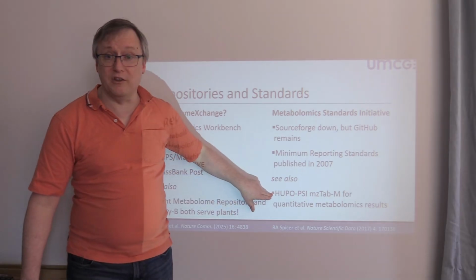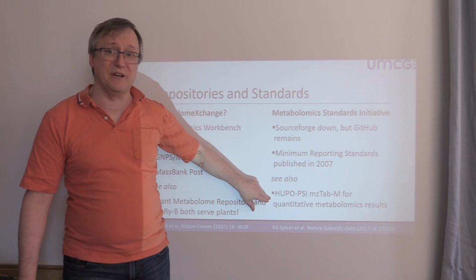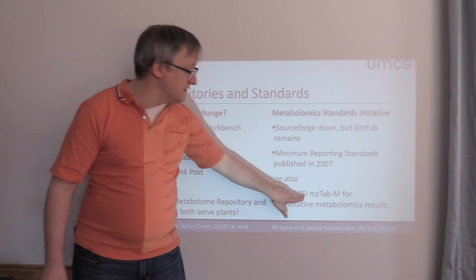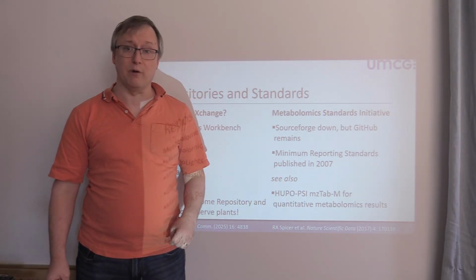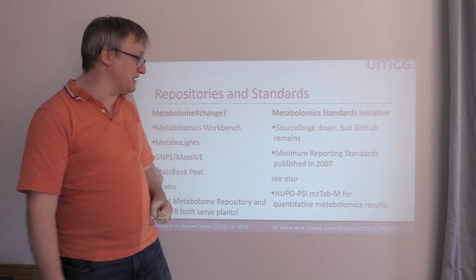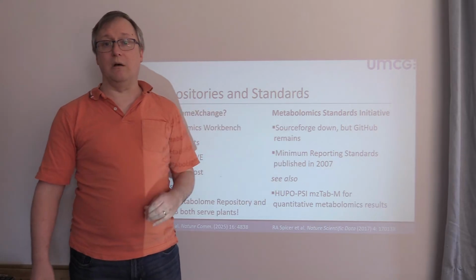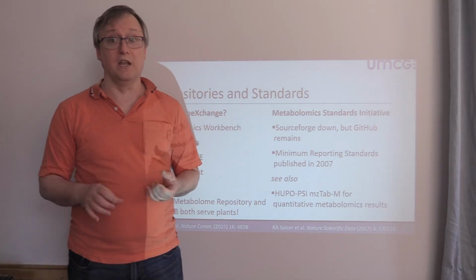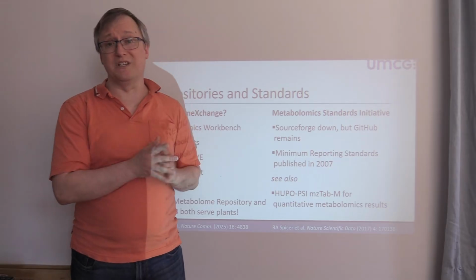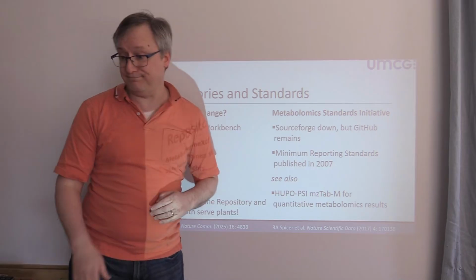But the group I'm in, the Proteomics Standards Initiative, has also been spending a little bit of time thinking about metabolomics. So the MZ-Tab-M format is designed for reporting quantities from metabolomics experiments. And I really believe that with the support of PSI, certainly, we believe that the Metabolomics Standards Initiative can keep doing the good work that they have been.